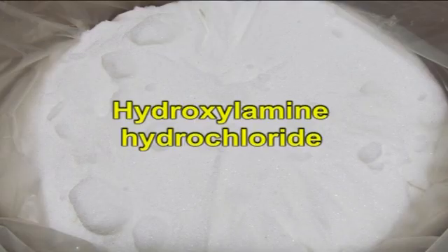If the sample contains ferric forms, then it must be reduced to iron 2 to produce the colored species. A suitable reagent for this purpose is hydroxylamine hydrochloride. The concentration of iron in the sample could be calculated from Beer's law.